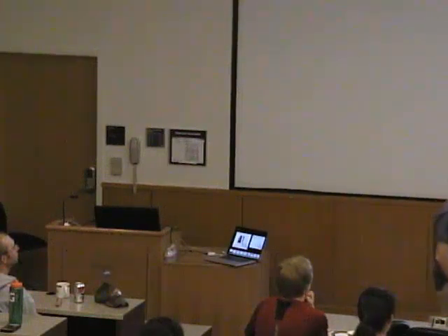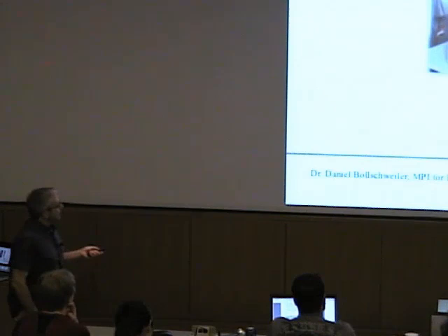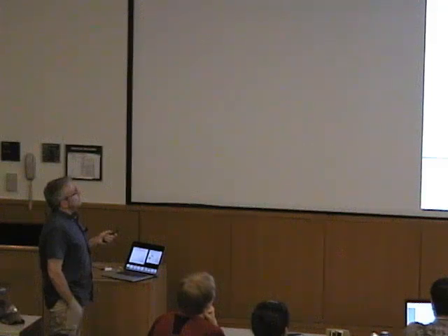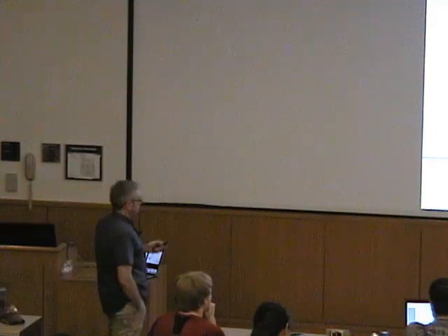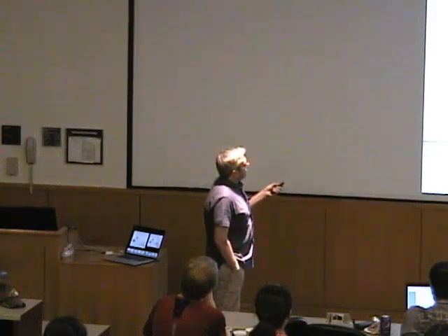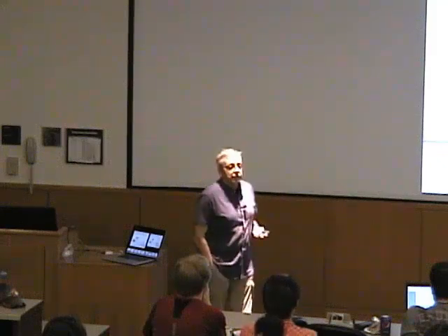And the reason that electron microscopy has made such a massive step forward in the last 5 years is due to this detector. And what has happened there has also happened in X-ray crystallography, because these CMOS sensor detectors have been developed that really changed the game for electron microscopy, and they did a lot to X-ray diffraction as well. Because what you can do with these detectors is you can directly count what's incoming, electrons or X-ray photons. So the old system was that you would basically have a detector for X-rays or electrons, where the electrons would hit either a scintillator in that case, or the X-rays would hit a fluorescent screen.